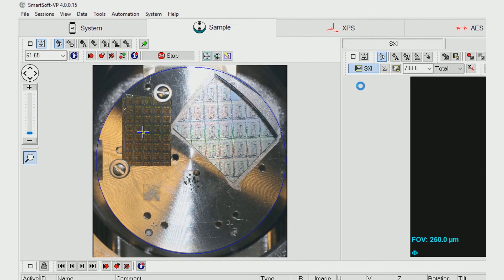In this demonstration, Image Registration will be used during the analysis of three different samples: a metallized wafer pad, a solder ball, and a particle of manganese carbonate.